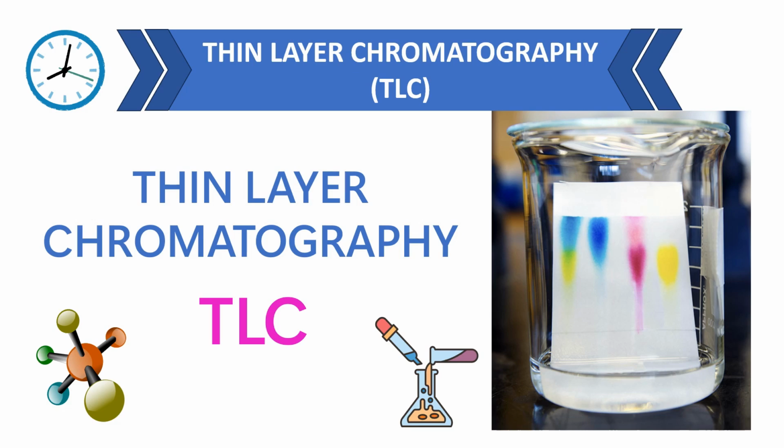Today's topic is thin layer chromatography, that is TLC. In this video we are going to learn what is TLC, how to develop a TLC plate and its applications. So let's get started.